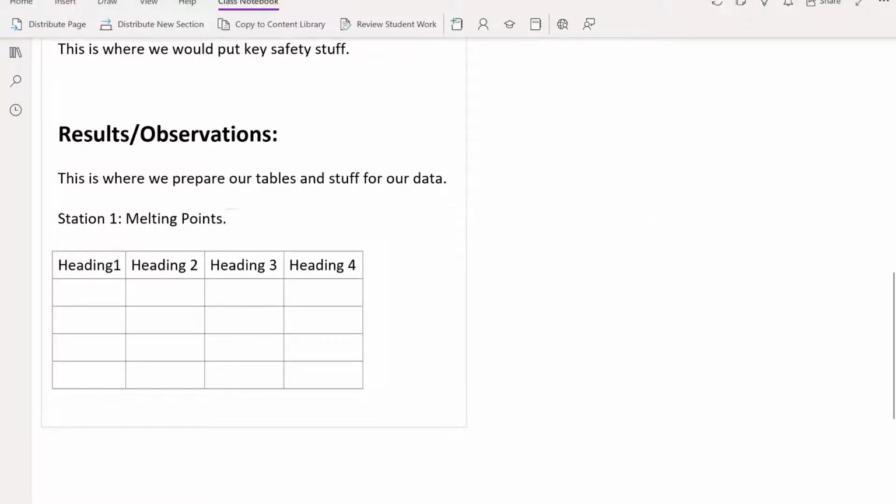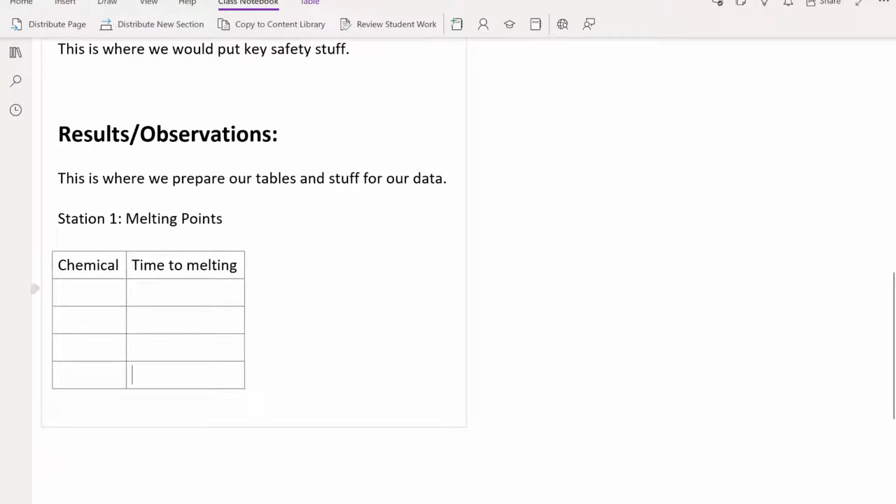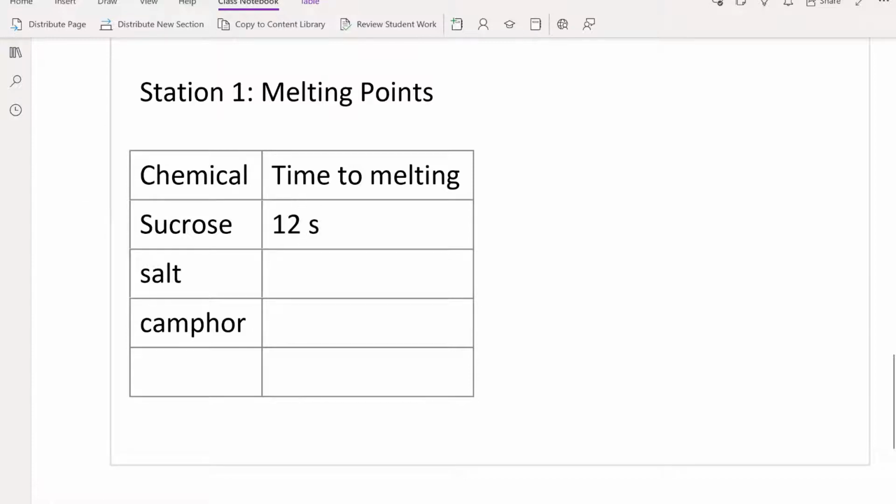And then I can get a table ready. And really for this one I just need chemical, time to melting. And that's it. And I could be like sucrose, salt, camphor. And I can just write these down. Oh, sucrose took 12 seconds to melt. Oh, salt only took 3 seconds. I can just have my data there. But I'm ready for when we're actually in the lab. I've got a table ready and waiting.